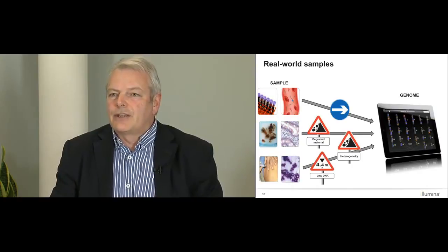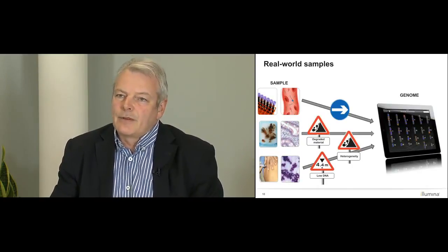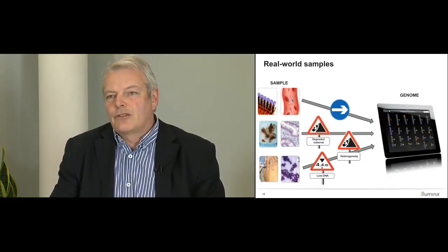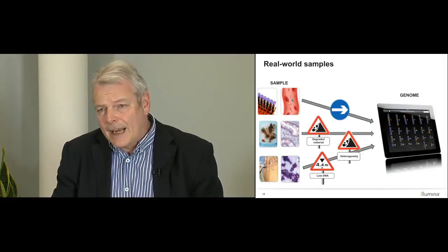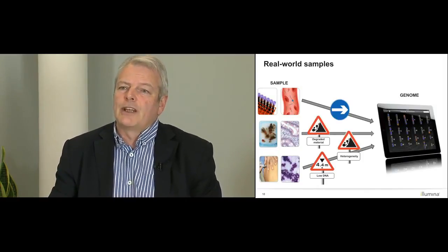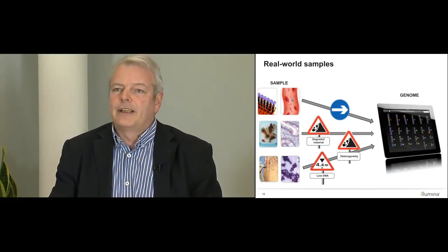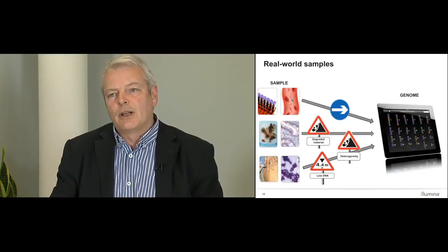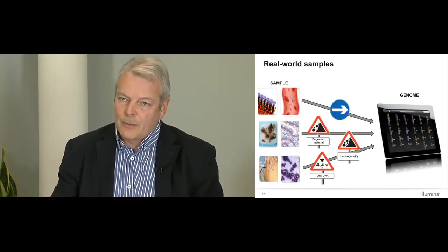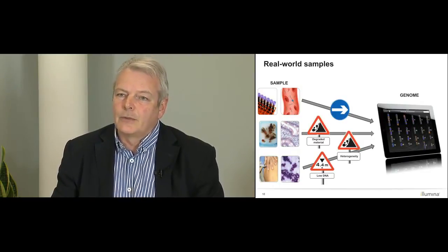But illustrated also two other ones, in particular the use of FFPE DNA, DNA which comes from formalin-fixed, paraffin-embedded tissue, which is in blocks, which is an extremely suboptimal way of treating DNA, although it's very good for histology. But this has become a major source, potentially, of tumor DNA samples. This DNA is degraded, it is modified, it is damaged. And so we have to look at modifying protocols to see how effectively we can actually generate data, whether targeted or whole genome, from FFPE material. And I'll just show you a slide on that in 1 second.